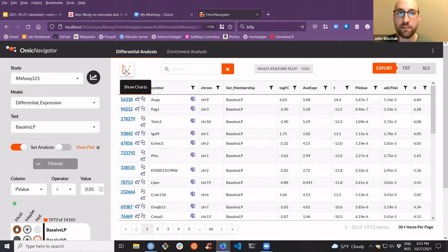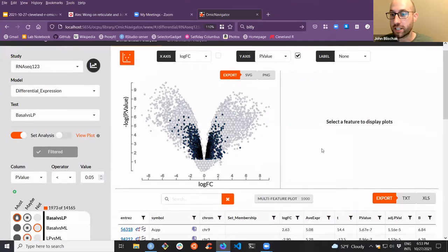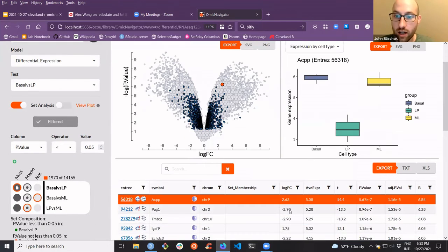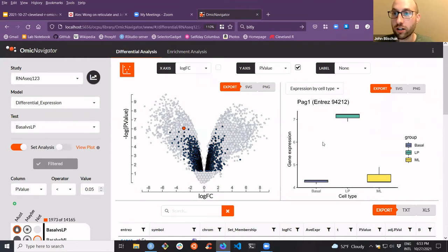And we have multiple ways of getting in custom plots. So if I select a feature here, what it's going to do is this is an R function I wrote. So let's say as a bioinformatician, I want to write a really bespoke function. I can write whatever function I want. And then as the user goes through the app, it'll automatically be run through R and generate that new plot. You could have multiple. This one just has one.